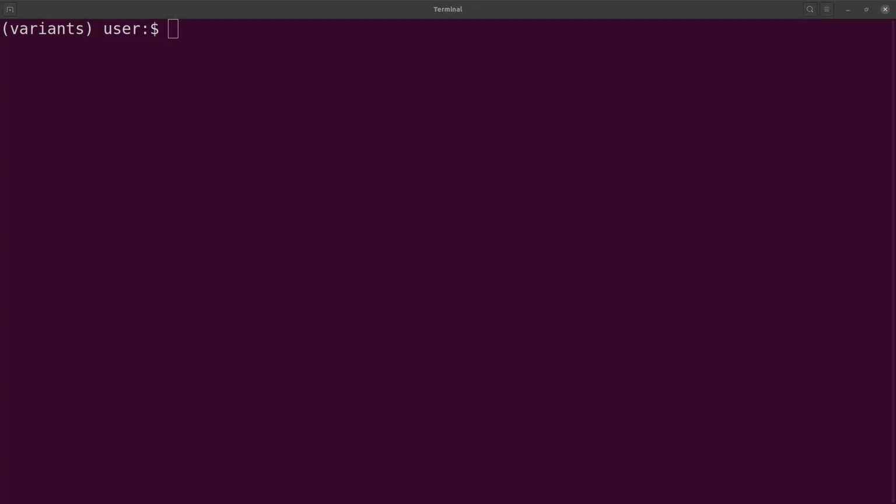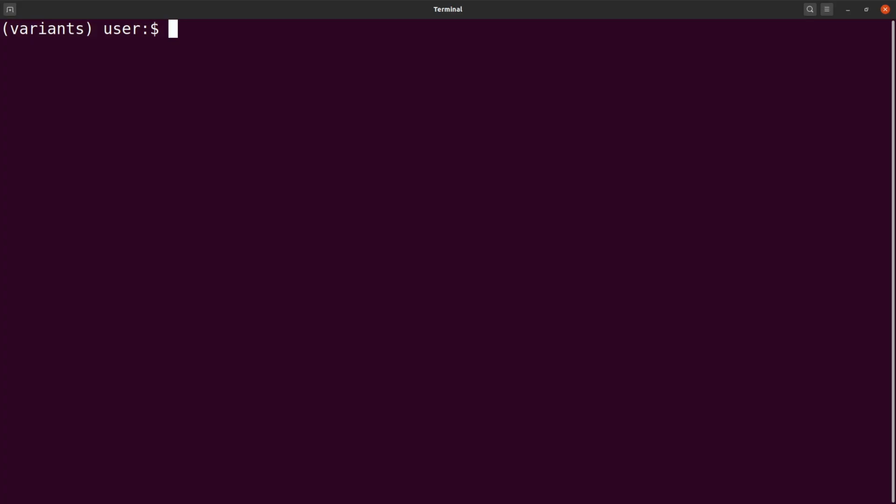Let's type sickle first, and then let's type PE. And then we will indicate the forward reads with -f. So the name is P7741R1. That is read 1. Now, with the reverse, we use -r. So let's also indicate the name. That will be P7741R2.